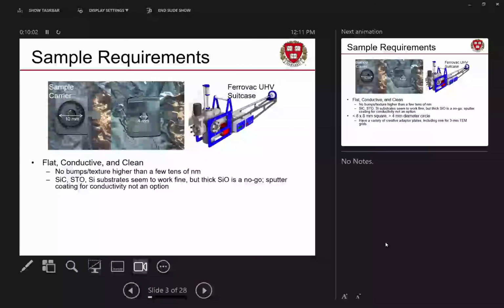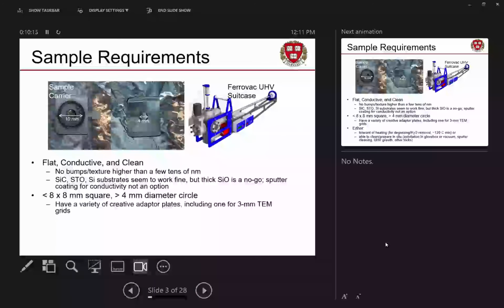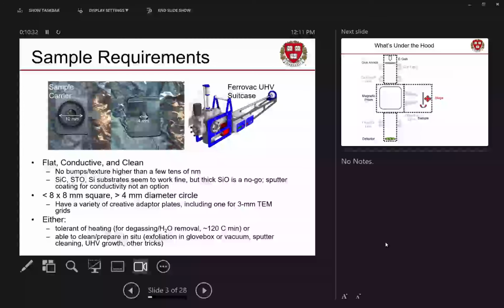In other electron microscopies, we will solve the conductivity problem by sputtering some gold or something on top of your sample. You can totally do that here, and then all you'll see is gold, because it's a surface microscope, and all it looks at is the surface. Sample should be less than 8 by 8 millimeters square, more than 4 millimeter diameter circle, otherwise it would fall through the hole and fall out. But I've made a bunch of different adapter plates for different size samples, including TEM grids and things, so we can accommodate most people's materials as long as they're not really big.